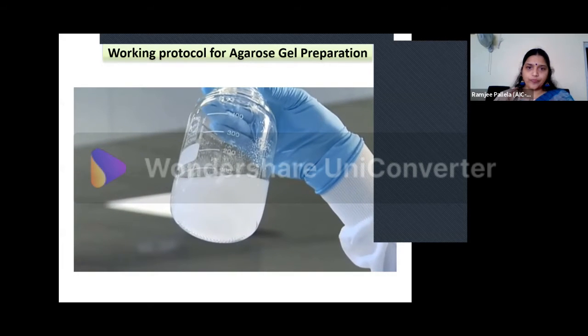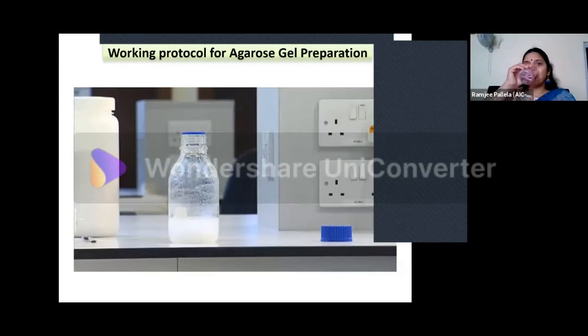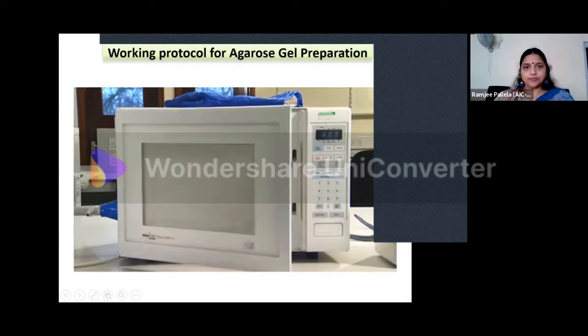The next step is to heat the agarose and buffer mixture in a microwave oven until the agarose is completely dissolved. Make sure the container holding the gel mixture is large enough to allow for the solution to boil up without coming out of the container. A loose cover should be placed over the top to prevent the solution from splashing out.